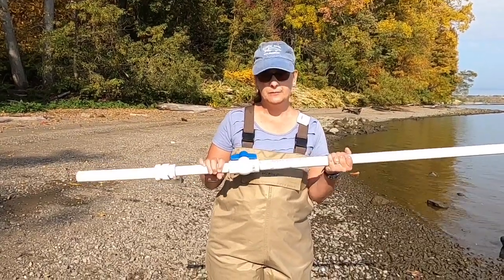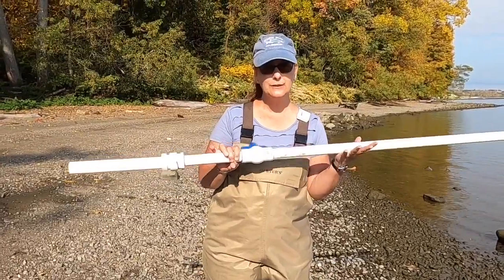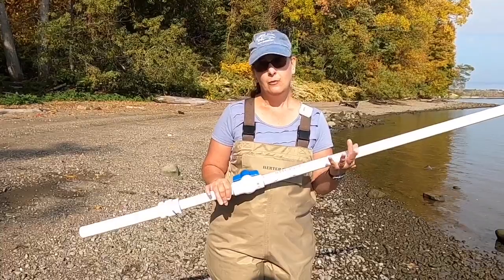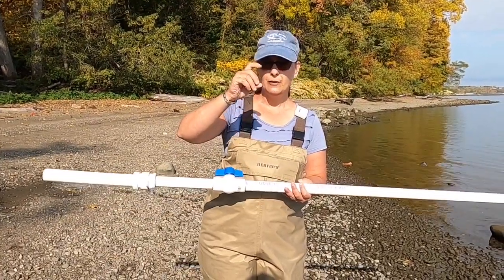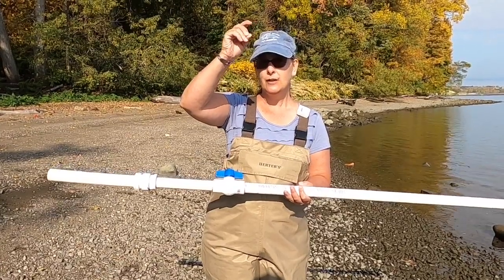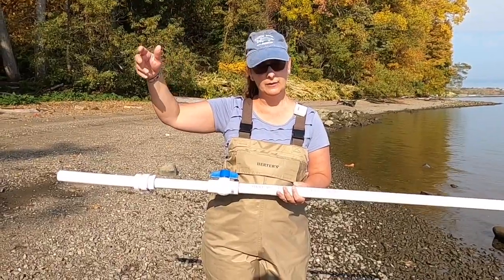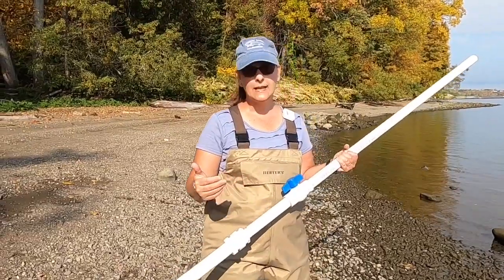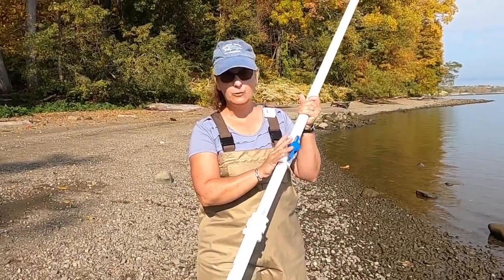We're going to do a soil and sediment sample using this tool. It works like a soda straw: when you put it in liquid, put your finger over the top, and lift it, the liquid stays in the straw. You can then move it and release your finger so the liquid goes into another vessel. We're going to do that to get a sediment sample. This piece of equipment is really cool.